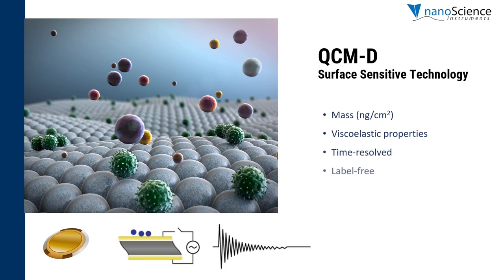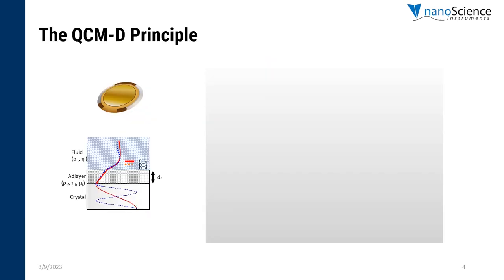Quartz crystal microbalance with dissipation monitoring, that is QCM-D, is an acoustic-based, surface-sensitive technique that measures real-time nanoscale mass and viscoelasticity changes at interfaces as a result of molecular interaction or reaction. This technique is non-invasive and label-free. The heart of the technology is the quartz sensor.